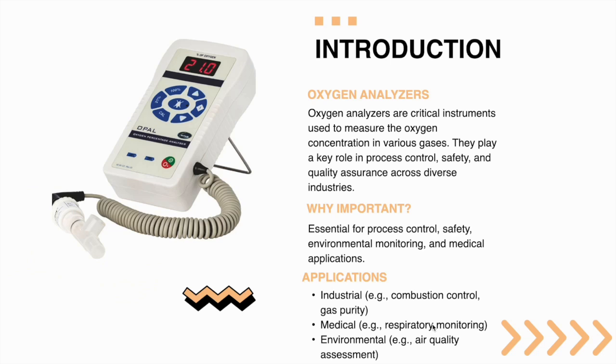So now moving on to the introduction of oxygen analyzers. Oxygen analyzers are critical instruments used to measure oxygen concentration in various gases. They play a key role in process control, safety, and quality assurance across diverse industries. So why is it important? It is essential for process control, safety, environmental monitoring, and medical applications.